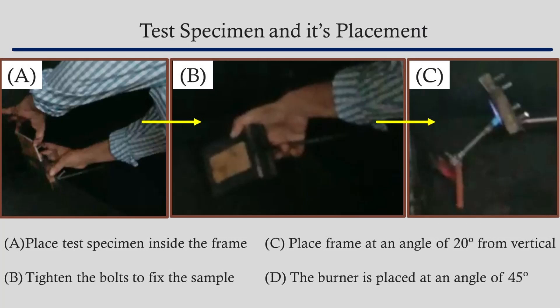We commence the experiment by placing the test specimen inside the frame. The bolts are tightened and the sample is fixed. The frame is placed at an angle of 20 degrees to the vertical and the burner is placed right before it at an angle of 45 degrees. The LPG flow rate is adjusted using the gas control valve. A lighter is used to ignite the flames, and the frame is then placed at a desired angle of 20 degrees.